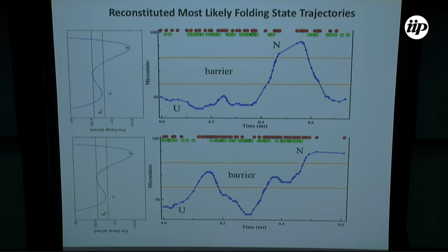Yeah, I mean, the hidden part is that basically, there are many ways of doing the same thing. You can just define the one that is most likely. And this is the caveat of the process. Okay, so this is why you cannot believe completely these trajectories. These trajectories are kind of made up in a way, but they are the most likely ones.